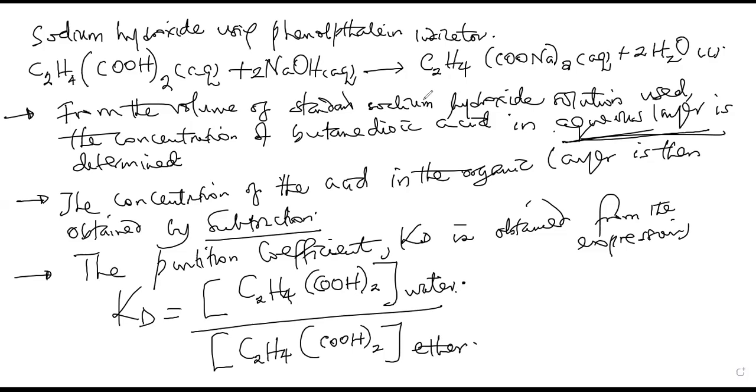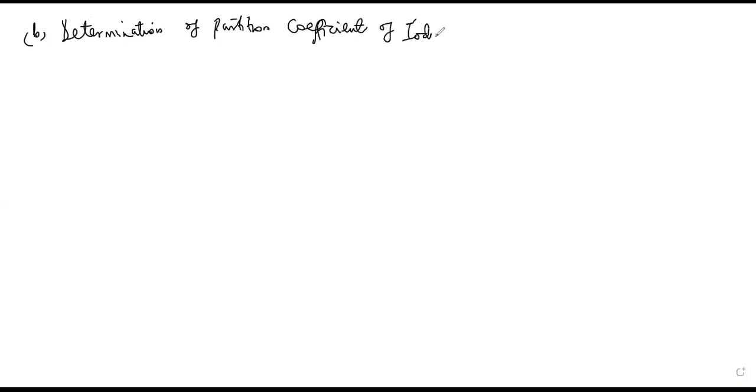Experiment B: determination of partition coefficient of iodine between water and tetrachloromethane.